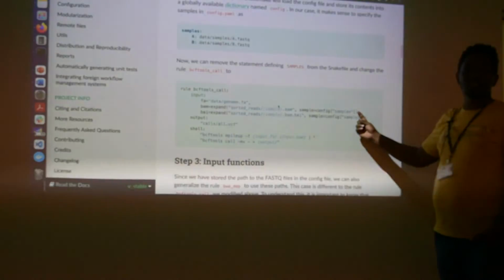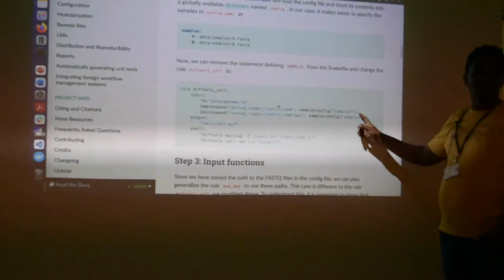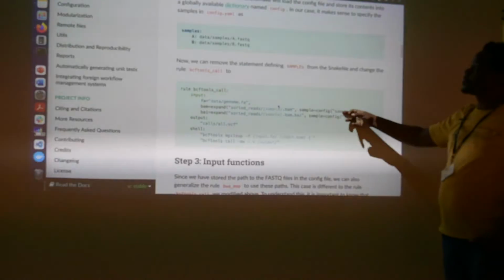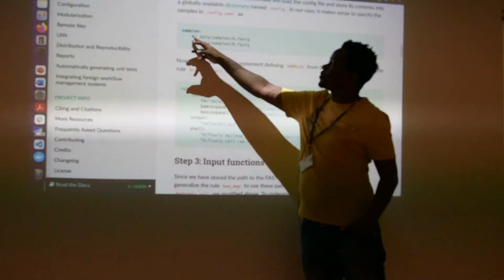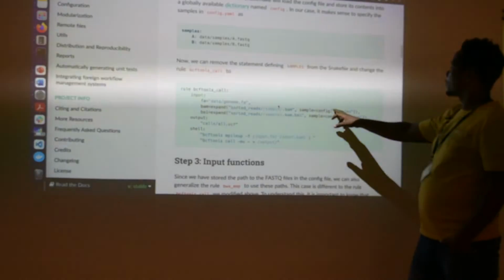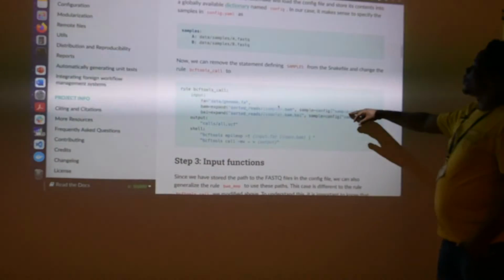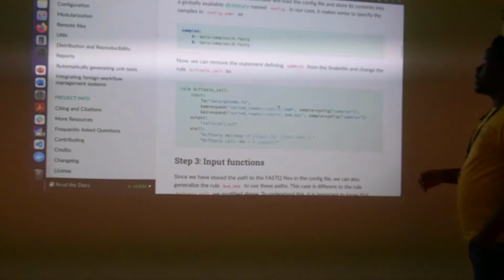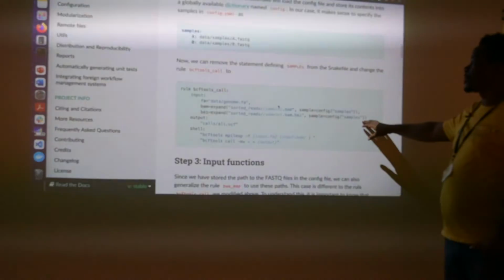So this is like a dictionary, I think, in Python, is it? It's a key value sort of data structure, right? So the samples will be read from here, and you can see that samples map to A and B, and therefore by specifying this with this sort of syntax and calling the samples, we're able to assign our samples, and the BAI index again is this file, and the samples are here.